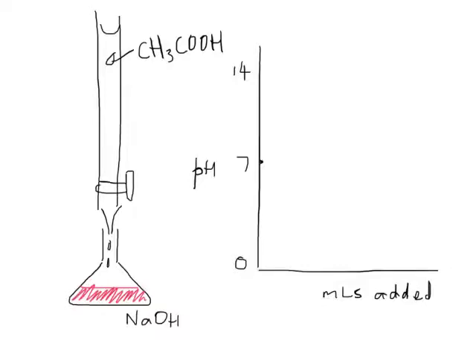Okay, I'm assuming you've performed the experiment as per the lab manual, which had sodium hydroxide in the conical flask down here, and the ethanoic acid in the burette. And when you put your indicator into the sodium hydroxide, that is the phenolphthalein indicator, it turned a pink colour.